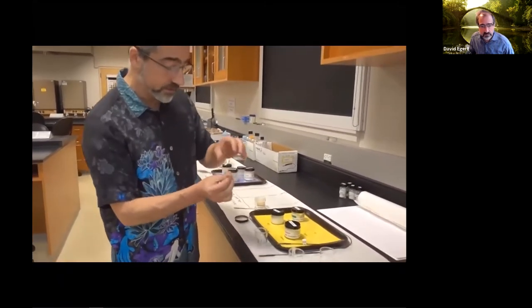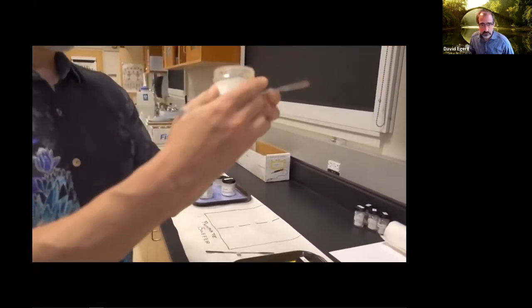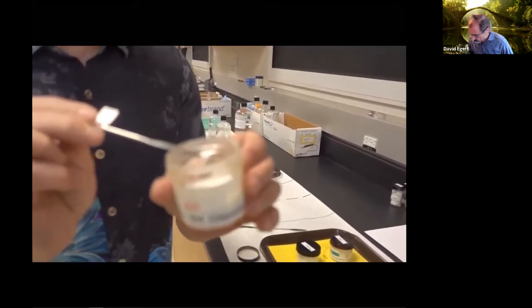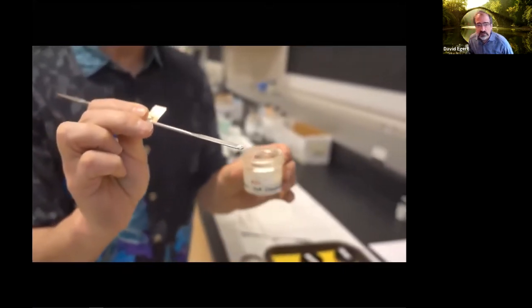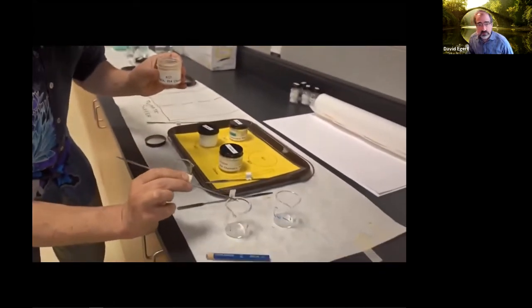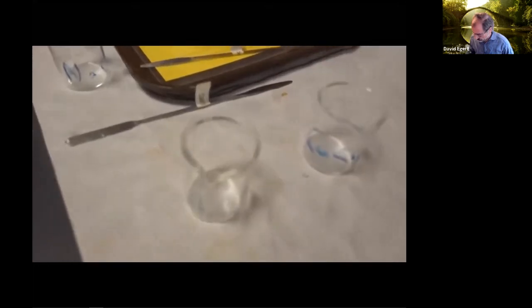So here, potassium chloride and a pinch, again, enough that you can see the end of your fingernail, but not too much, because if you try to dissolve a whole cup of sugar in a teacup, it's ridiculous.